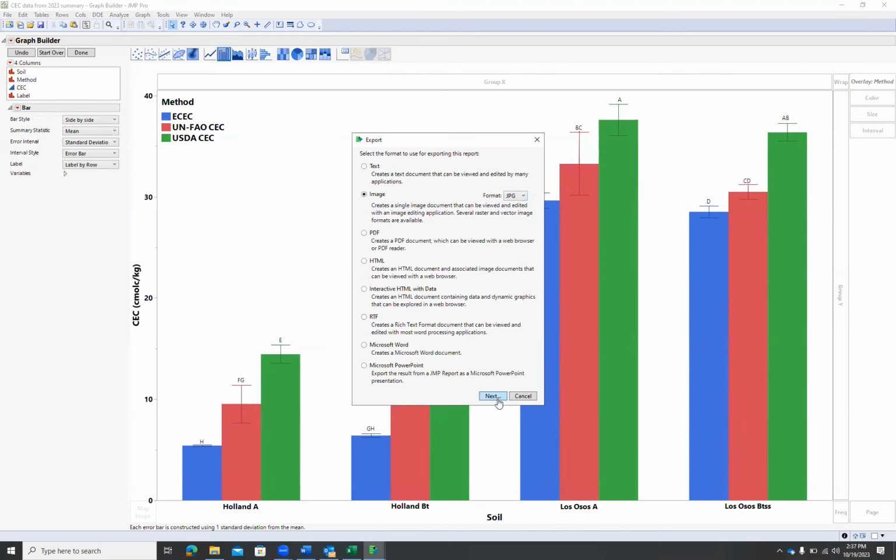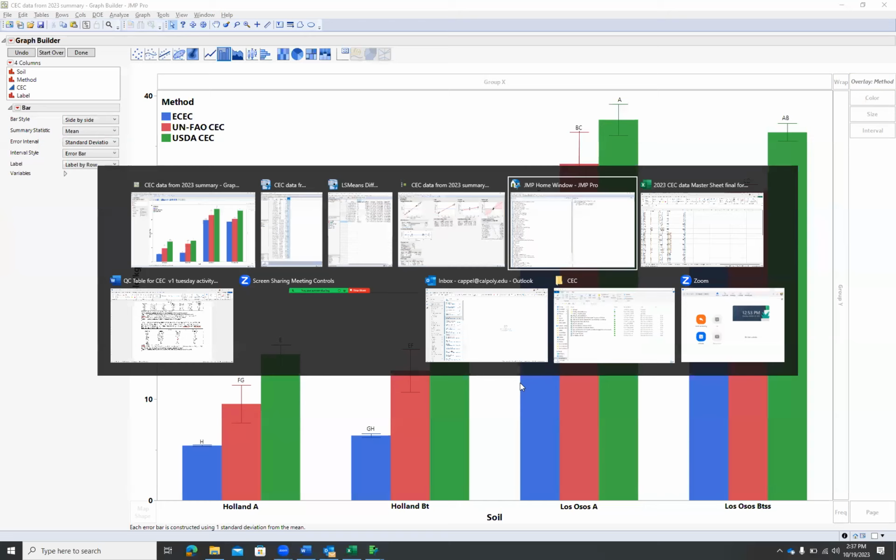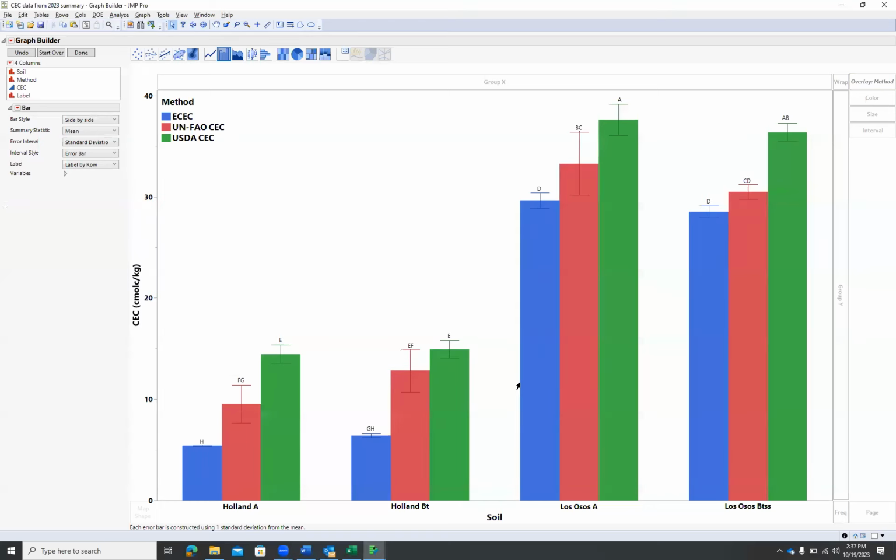Yeah, Lee. How do you open up the graph builder? How did I open up the graph builder? I just hold down the Alt key, and then I hit Tab, and that'll go to all my windows by clicking on the tab. No, I lost the window. You lost the window? So if you just open up that graph again, oh, you go.